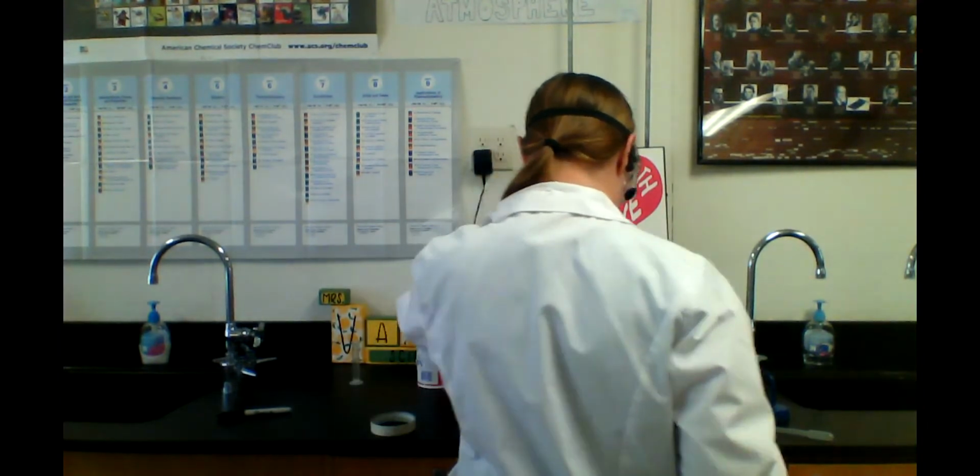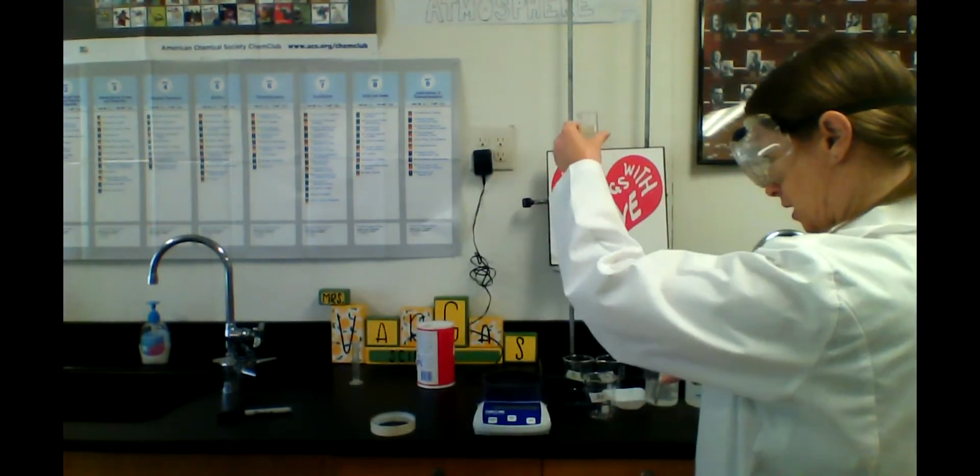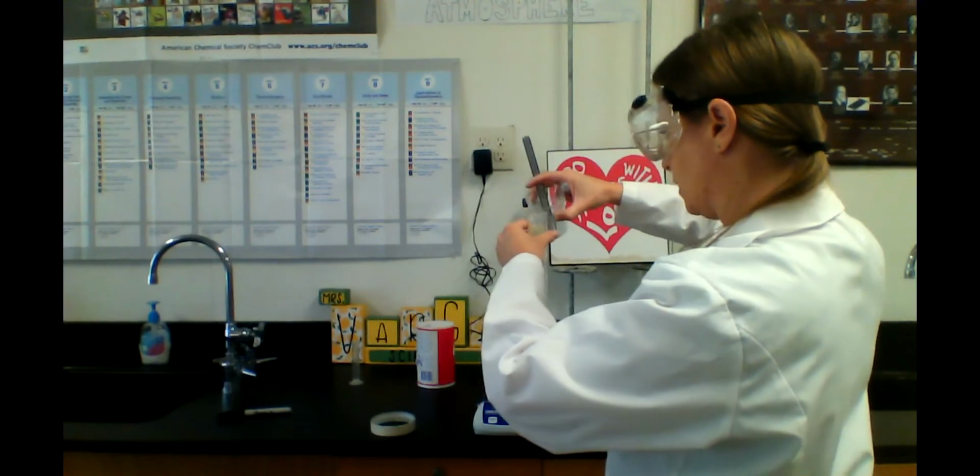So now let's go ahead and prepare our 20% solution. So in the 20% solution, we are going to need, I know I just said it and now I have to look again, 16 milliliters. So I'm going to pour into here until we get to about 15.